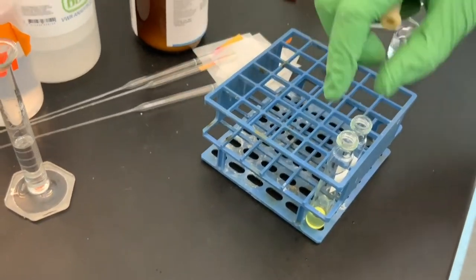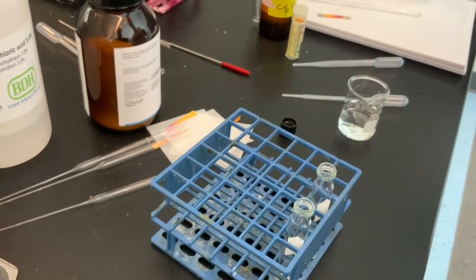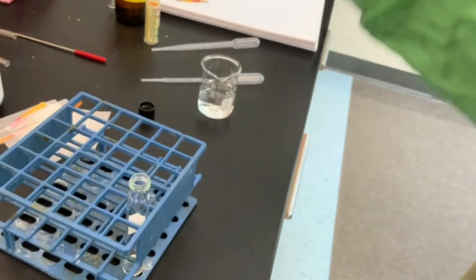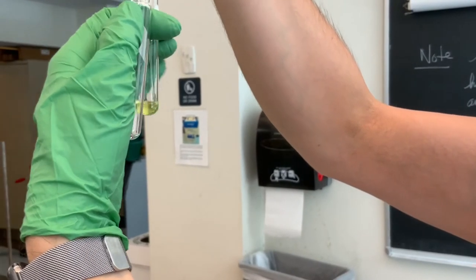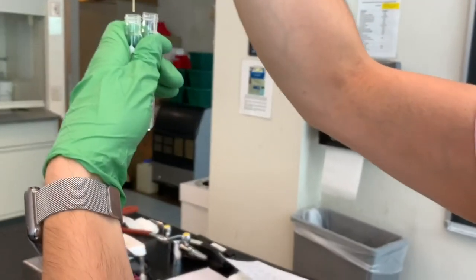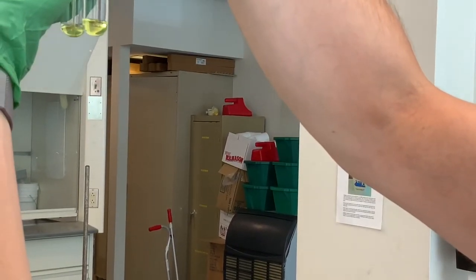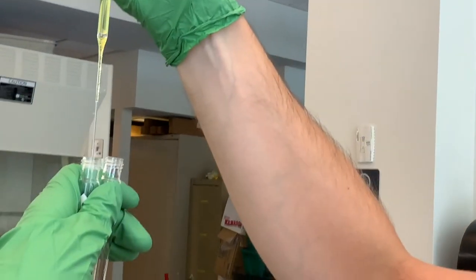And so I'm going to want to transfer this organic layer to a new culture tube that hasn't seen any water yet. I, of course, would want to use a new Pasteur pipette and add it to a completely dry new culture tube, right? And if I see any water present, I'm going to leave it behind, but I really want these close together, because I know that the vapor pressure of methylene chloride, it's already just spitting out. So that's the first one. See, I can see a little bit of water on either side, so that's what I'm trying to get away from.